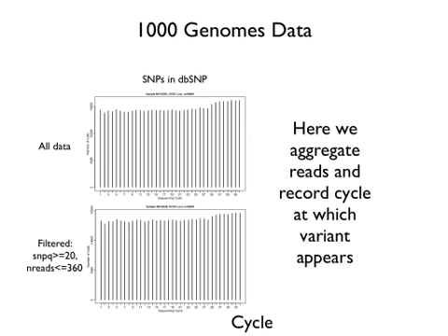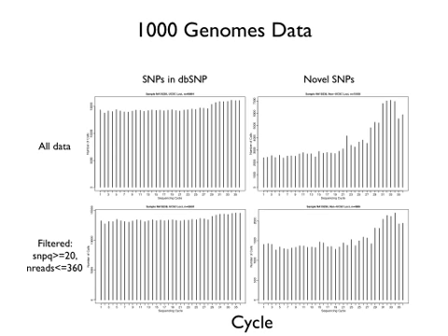But now look at the novel SNPs. It's common to have novel SNPs coming from the ends of the reads, and that is the sign of false positives. Okay, so that plot is saying it's more common for a SNP to come from the end of a read than from the beginning. That's not what we want. That looks like they were fooled by this error at the ends of the reads.